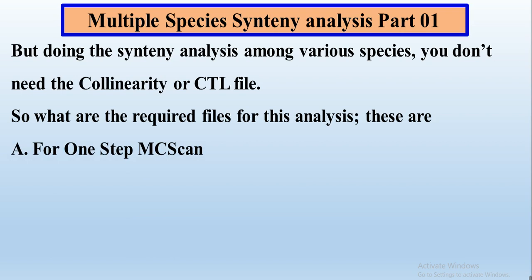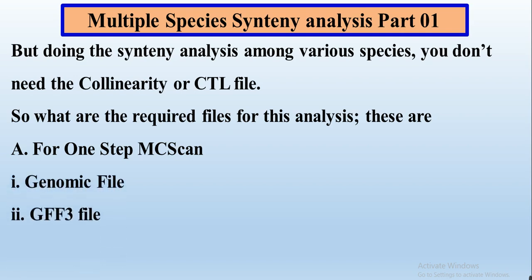This process comprises three steps and we will discuss all the steps one by one. In the first step we do the one-step MCScan process, as we have already done in the two-species synteny analysis. For this purpose we need the genomic file of our organisms — two, three, or four species for which we want to know the collinearity analysis of our gene family.